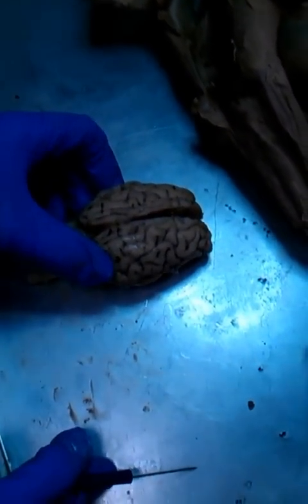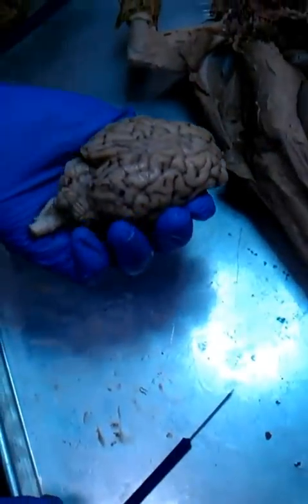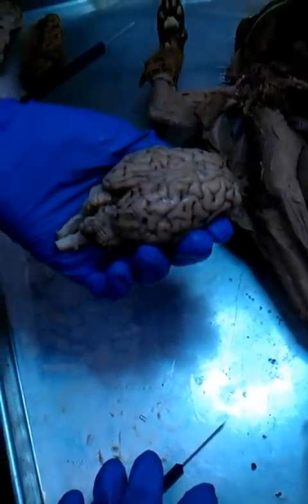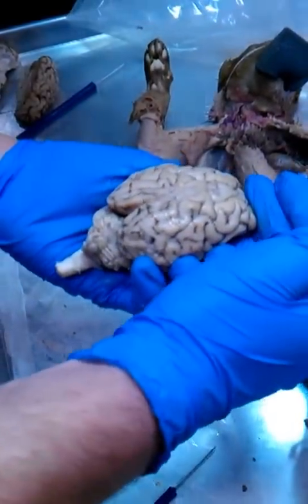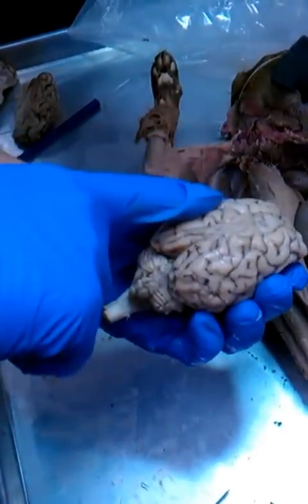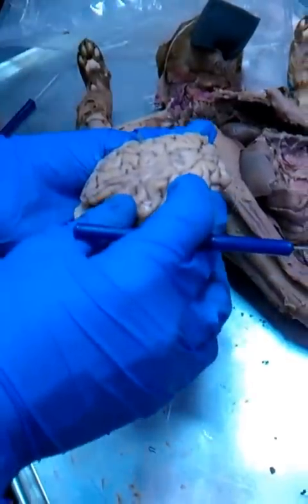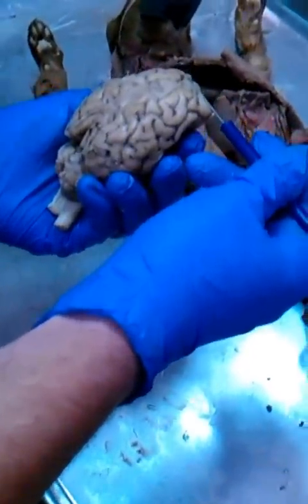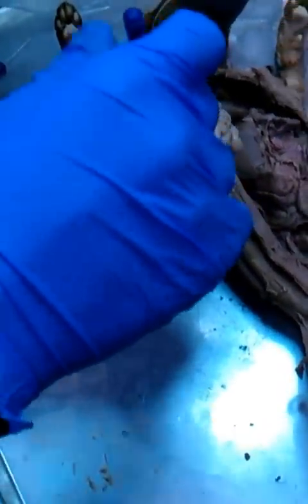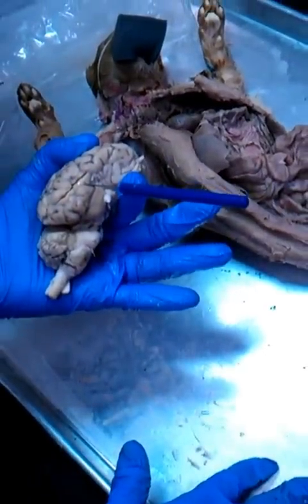Close enough. So here's the deal. On the brain, first of all, when you look at it together, you have your two hemispheres. If you're looking at the brain like this, remember that the brain stem is going to be posterior, the other side's going to be anterior, making this the right, this the left. We also need to look at the lobes of the brain. We have the frontal lobe, which is going to be on the front here. The parietal lobe is going to be more on top there. The temporal lobe is going to be on the side of the brain, like that.